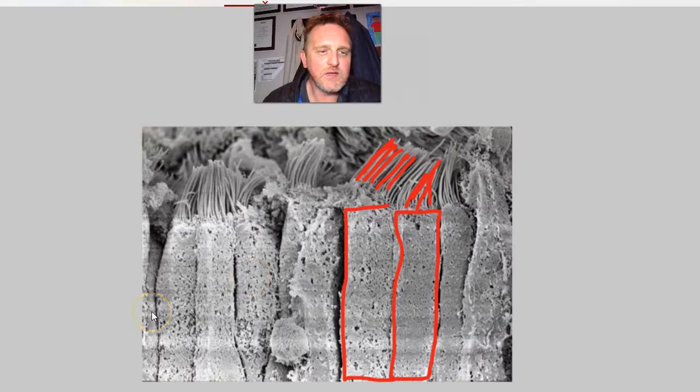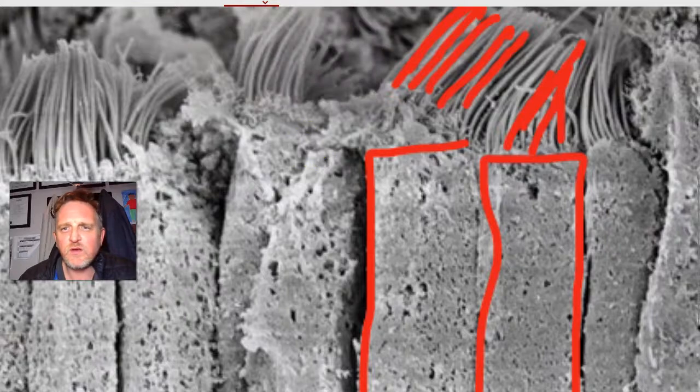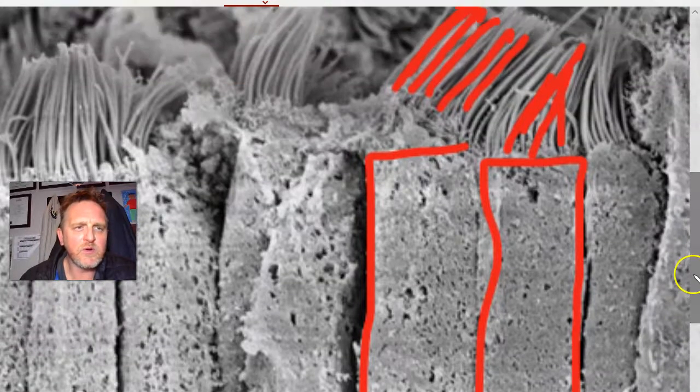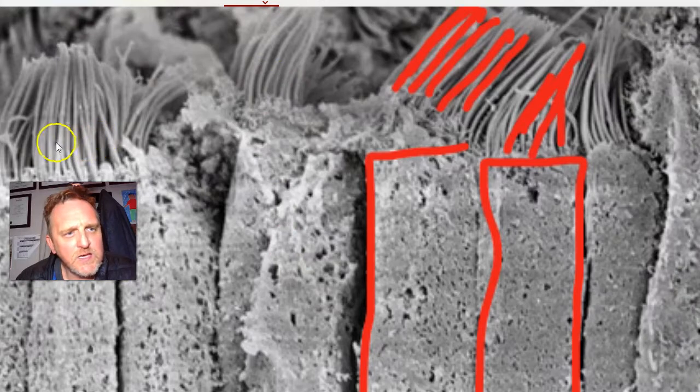Just absolutely an incredible visual that was captured here. See how close we can get to it. Just a wonderful image to show you the incredible resolving power of an electron microscope, to be able to tell the difference or separate the spaces between those individual cilia.